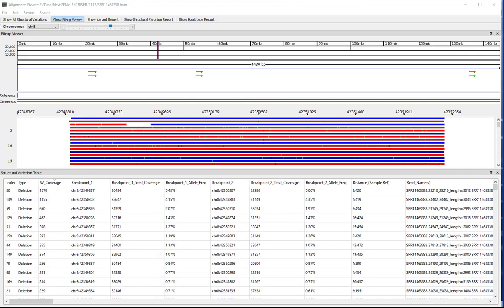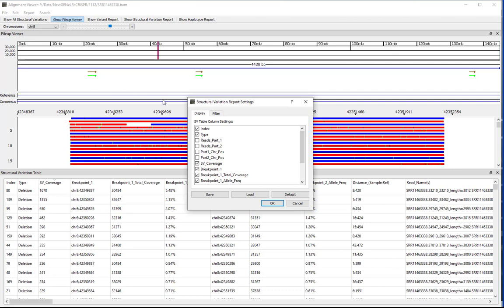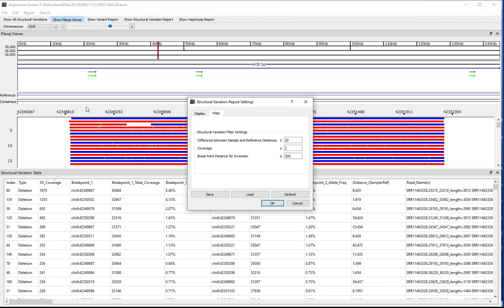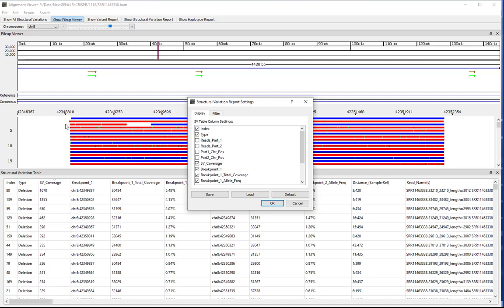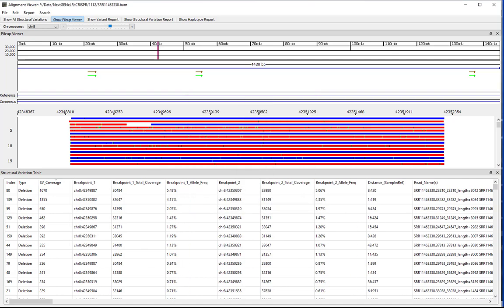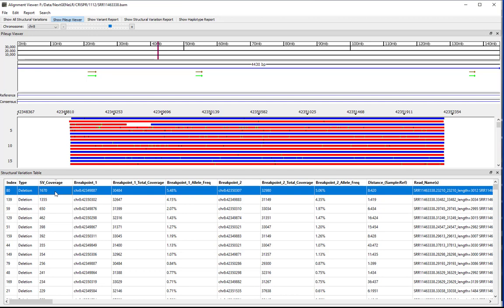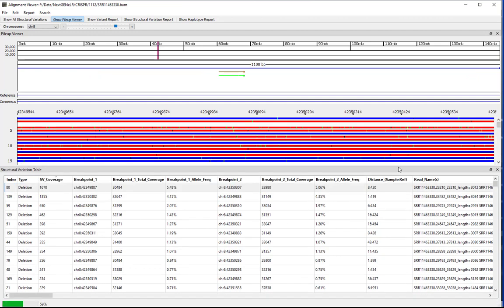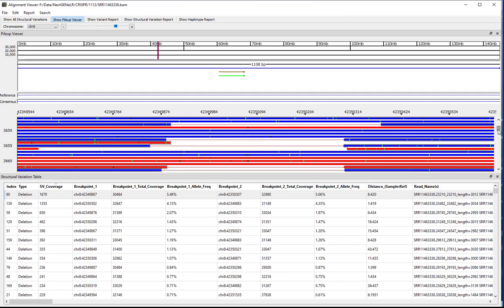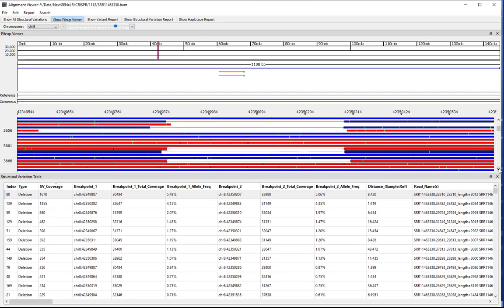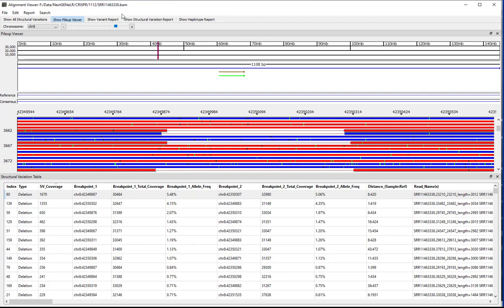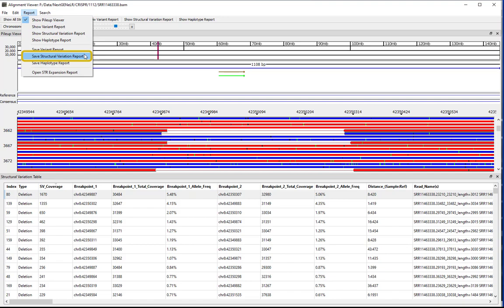You can modify the report settings by going to Edit > Structural Variation Report Settings. Click on the Display and/or Filter tabs to specify the settings for the report. You can also save the report settings by clicking Save. A saved configuration file can be loaded in the future by clicking Load. Click OK to return to the report using the specified settings. You can double-click on any structural variation in the report to view the variation in the read pileup — a solid line is shown connecting two parts of a read where gaps occur. You can save the Structural Variation Report by going to Report > Save Structural Variation Report.